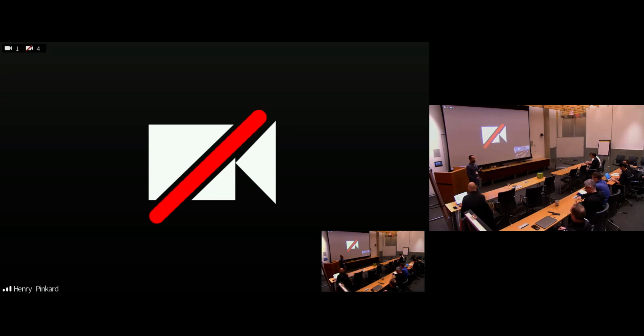which, as most of you know, is a very powerful platform, a closed platform, which has an integrated suite of hardware and software solutions, and it's a graphical user interface. So you are basically connecting wires as if you're wiring electronics, and for loops, you're basically putting things inside a box. So for an electrical engineer that wants to prototype, it's very easy and convenient. But at the same time, it does come with a lot of baggage in that over time, your code gets very massive, and the code base becomes very much a spaghetti, right? And it doesn't integrate very nicely with GitHub, so there's no version control and so on.